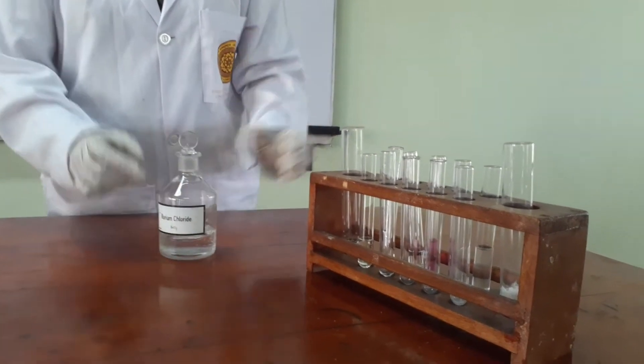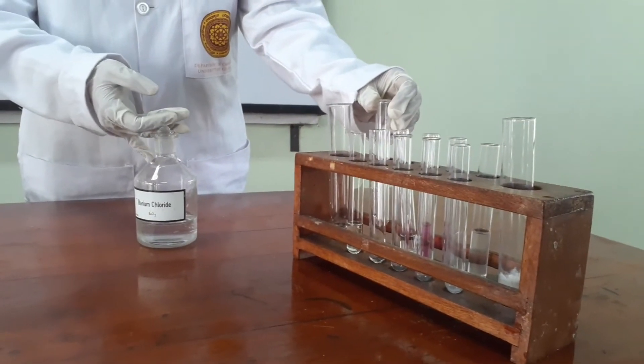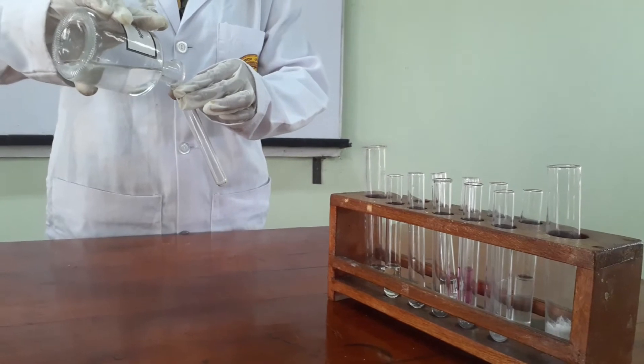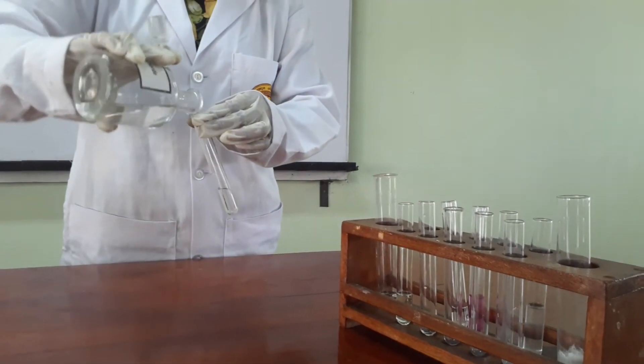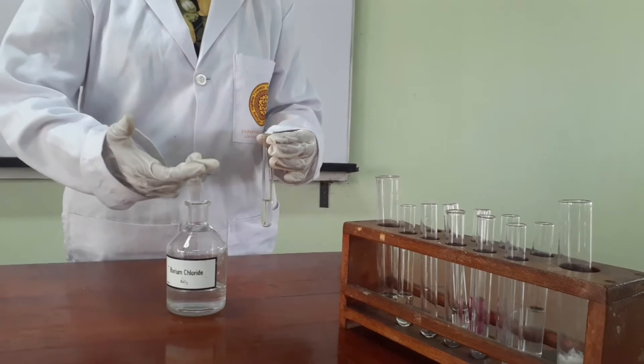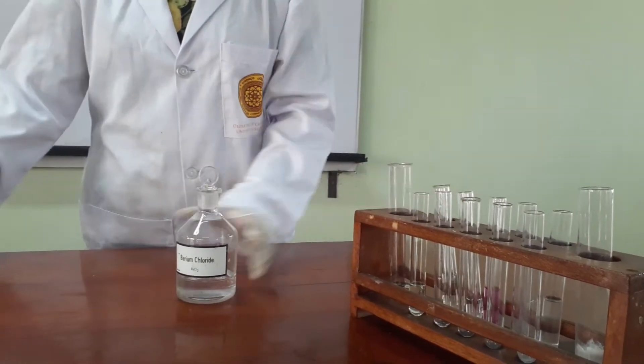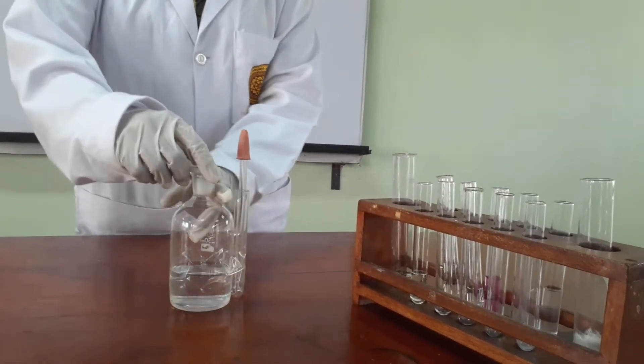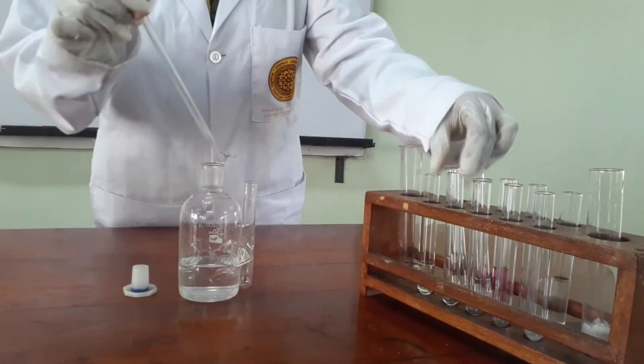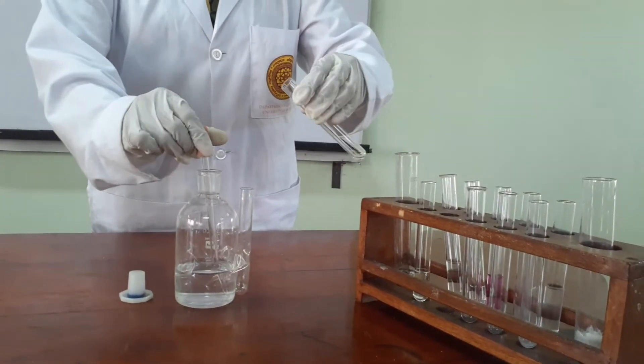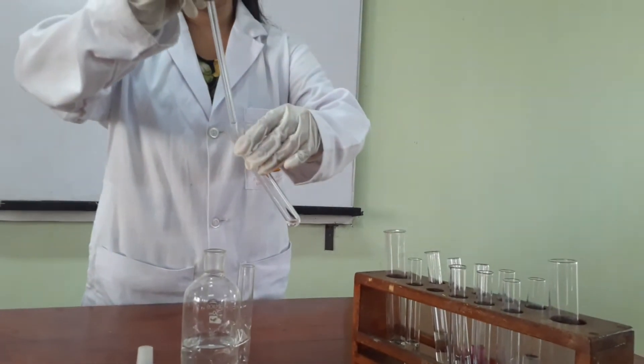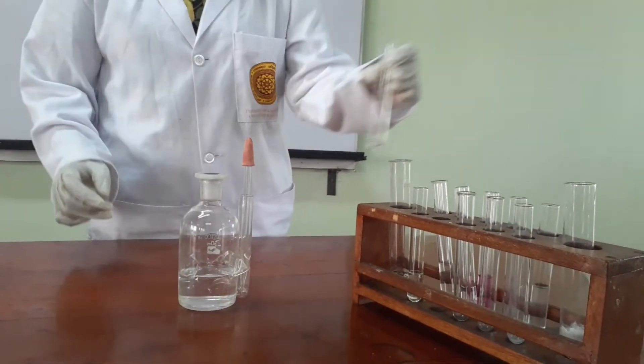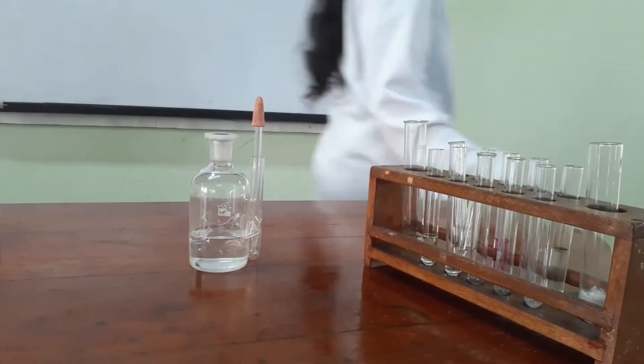When we are using these reagent bottles, we hold the cap with two fingers like this and pour the solution into a test tube. And then we take whatever amount that we need using a dropper. And we close the reagent bottle like this. Instead of using this reagent bottle, we can use this reagent bottle which is attached with its own dropper. So we can easily use that dropper to take the specific amount of reagent to a test tube. We do not need to take extra amount of reagent to another test tube.